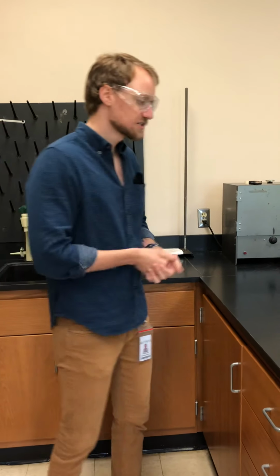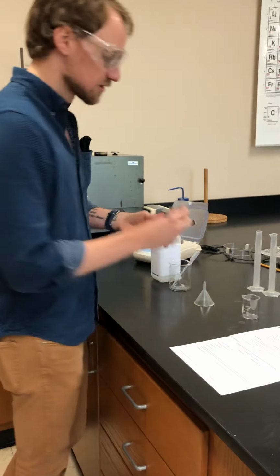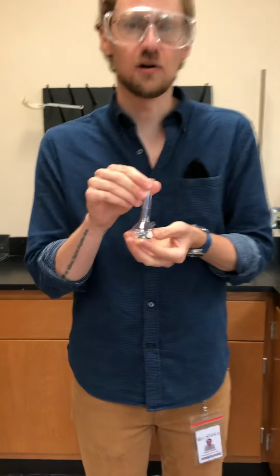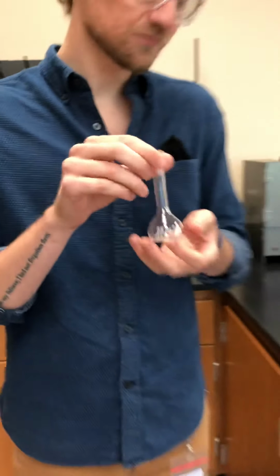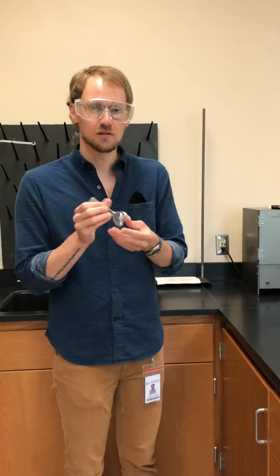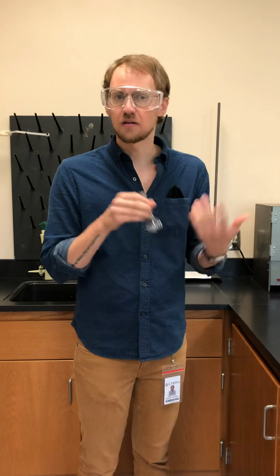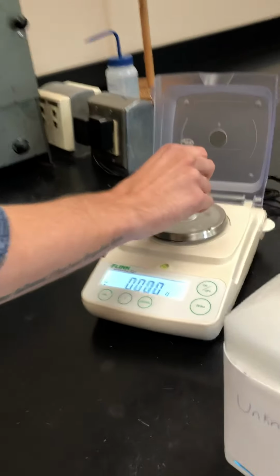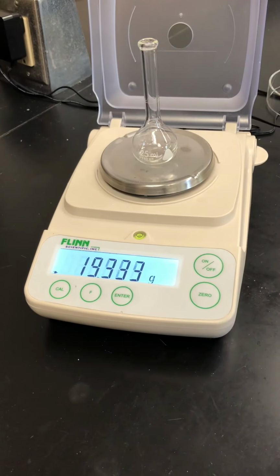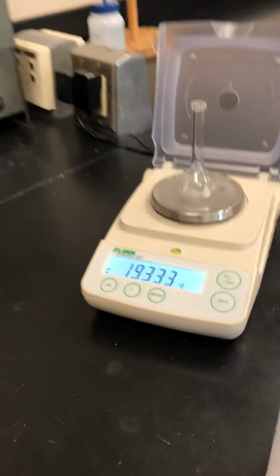All right, so we're basically going to follow the same procedure that you followed with doing water. So we've got our 25 ml volumetric flask. You should be familiar with this. You saw it in the last video. We're going to weigh this first, so that way we can get the weight of it empty. Then we'll fill it up with our solution, reweigh it, and you can get the mass. All right, so we're going to weigh this on our balance. It's already zeroed. We'll put it on here. You'll record this mass as the mass of the empty volumetric flask.